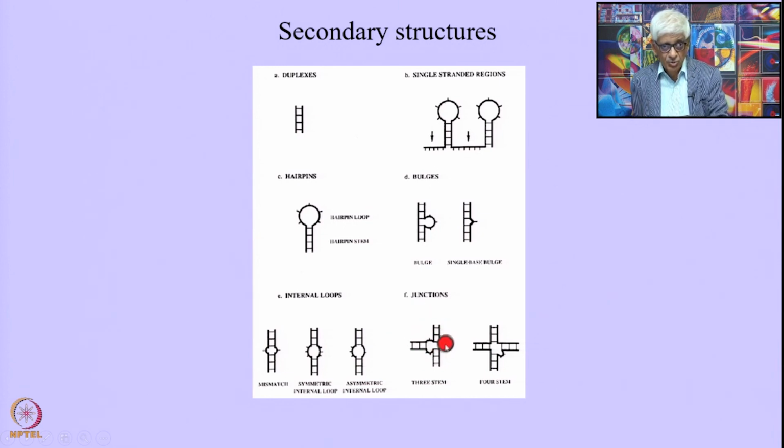So, these are all the possibilities indicating the folds of the nucleic acid structure, and you see here is a 4 stem structure, and such kinds of structures do occur in the functional aspects whenever there is a recombinant process going on, in the replication process. This is a 4-stem process.